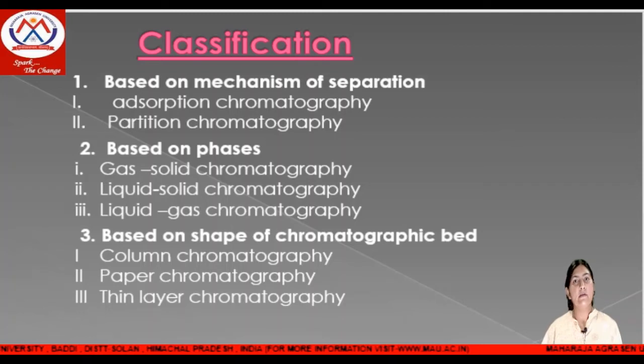Second, on the basis of phases: gas solid chromatography, liquid solid chromatography, liquid gas chromatography. Third, on the basis of chromatographic bed, we subdivide the techniques into column chromatography, paper chromatography, and thin layer chromatography.